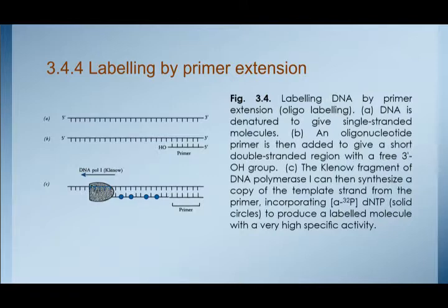The whole process can be carried out in a Pasteur pipette, with the labeled DNA coming through the column first, followed by the free nucleotides. Fractions can be collected and monitored for radioactivity, and the data used to calculate total activity of the DNA, specific activity, and percentage incorporation of the isotopes.